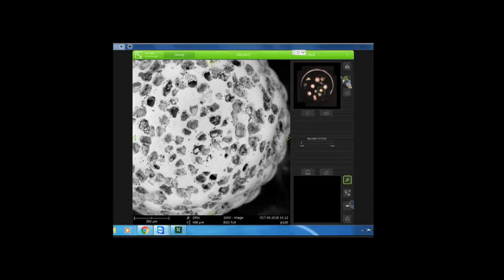Oh God, that looks like an asteroid. That's an asteroid. I wish it was an asteroid. This is actually what a marine fossil looks like up close, the little holes in it, and there's probably some diatoms that are inside of those little holes. But if you would like to get closer, you could go down.